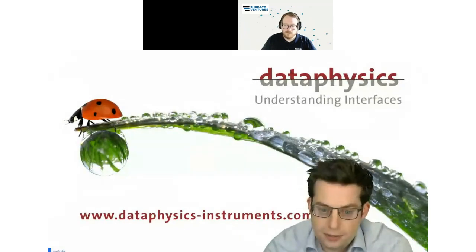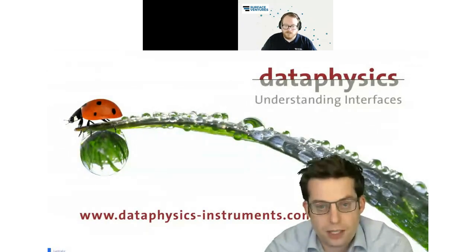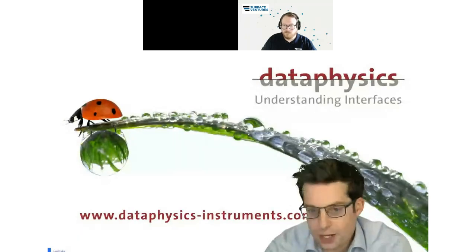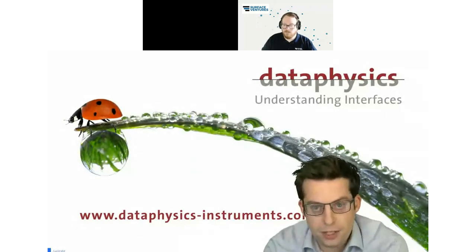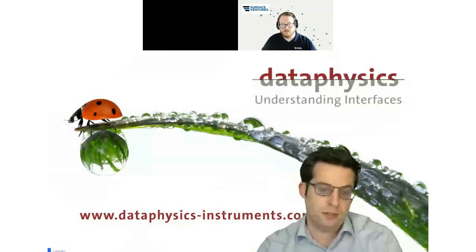So I would say fibers down to 8 micrometers in outer diameter are easily possible to measure with this device. And if they are much thinner, we still have one tensiometer with a more precise balance. It has 2 digits more, and then you can even go down to, I don't know, 5 micrometers outer diameter and still measure them. So that you are getting a number.